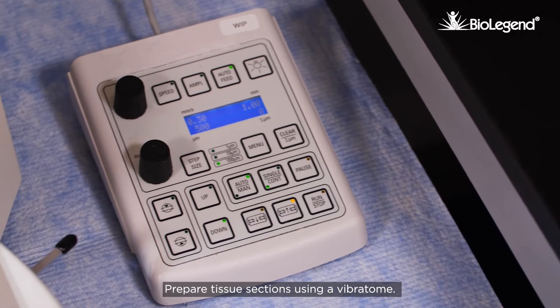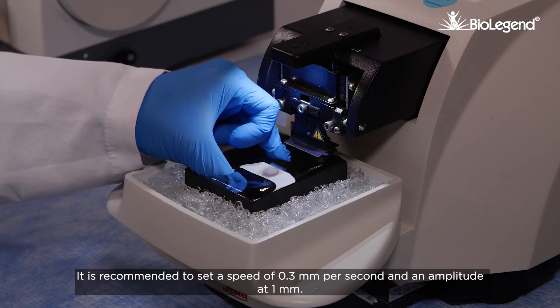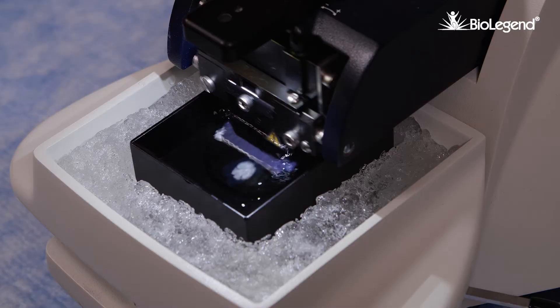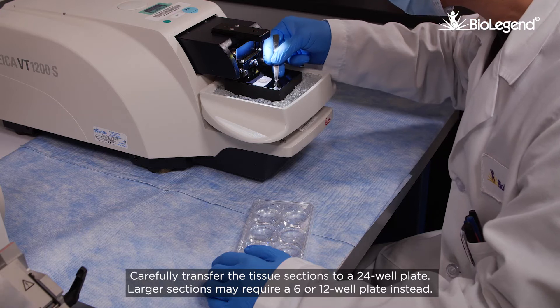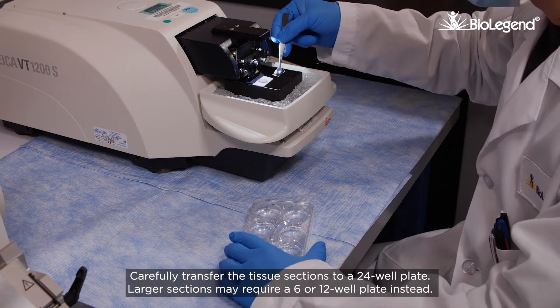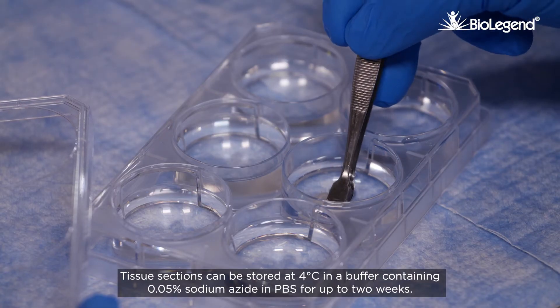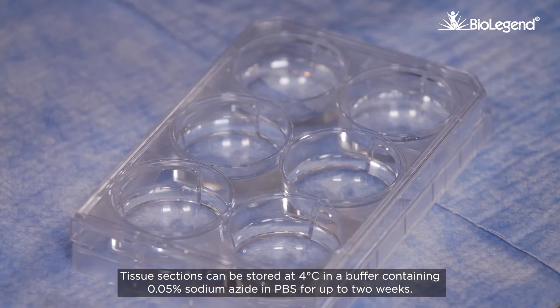Prepare tissue sections using a vibratome. It is recommended to set a speed of 0.3 millimeters per second and an amplitude of 1 millimeter. Cut 500 micron sections at 4 degrees Celsius. Carefully transfer the tissue sections to a 24 well plate; larger sections may require a 6 or 12 well plate instead. Tissue sections can be stored at 4 degrees Celsius in a buffer containing 0.05% sodium azide in PBS for up to two weeks.